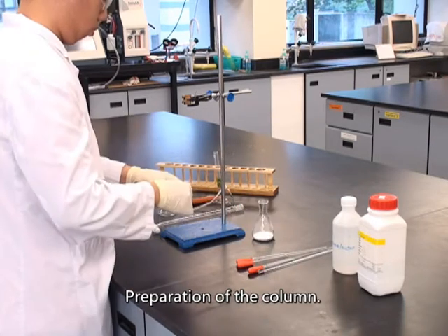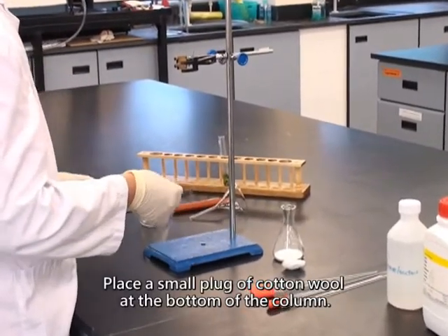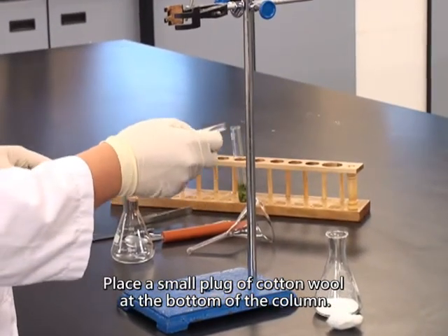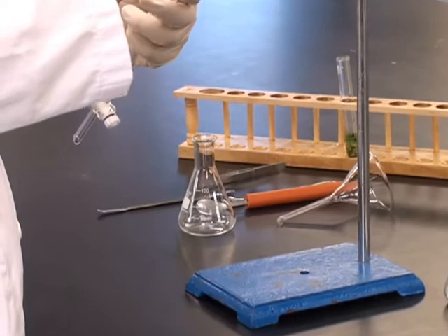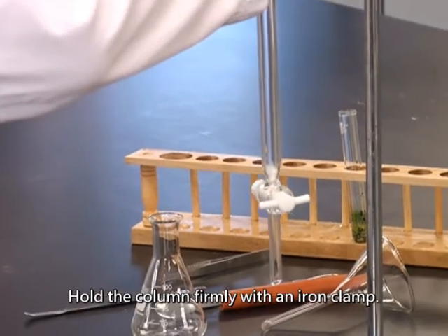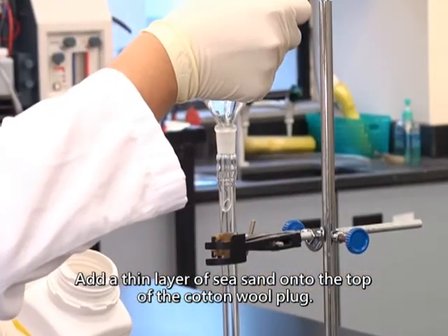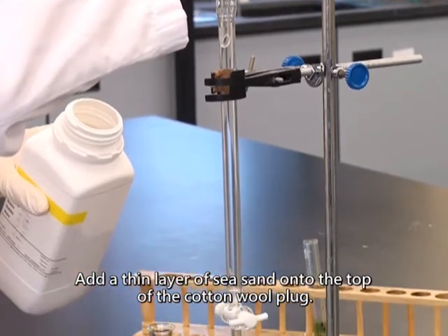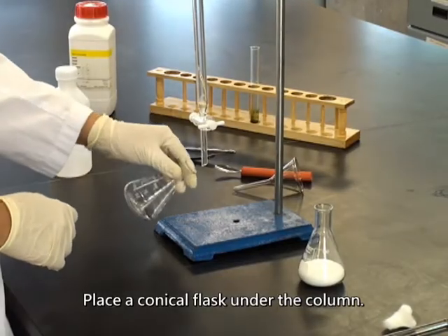Preparation of the column. Place a small plug of cotton wool at the bottom of the column. Hold the column firmly with an iron clamp. Add a thin layer of sea sand onto the top of the cotton wool plug. Place a conical flask under the column.